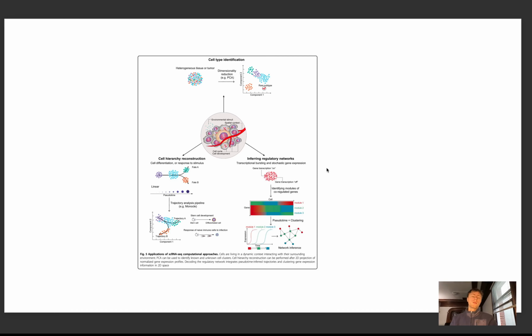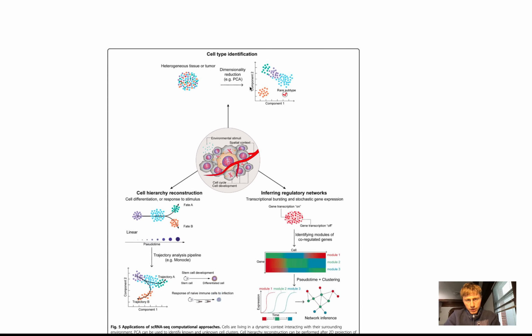The use cases, cell type identification. There's a very good tutorial by a person which I will link.